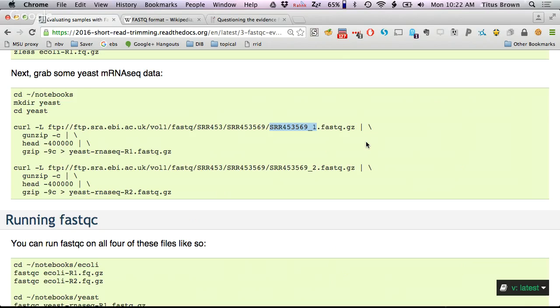Okay, so this is something that I don't think we do enough of in biology. I almost recommend the first thing you should do when you're doing a new type of approach, unless you're developing a new kind of approach, if you're just doing something that other people have done but with your own samples, is go steal their data and run the analysis you want to run on their data, because you know roughly what the answer should look like, assuming they published it.